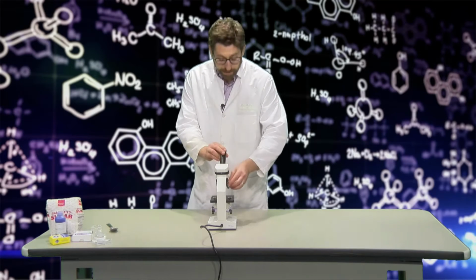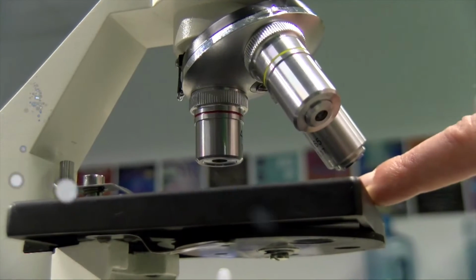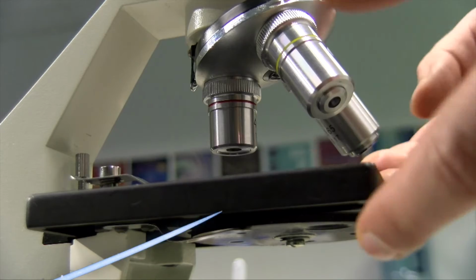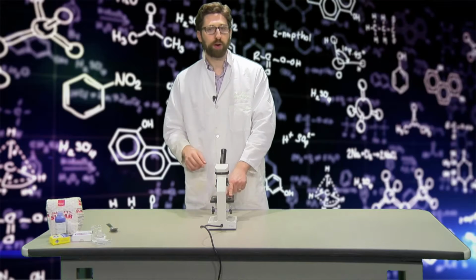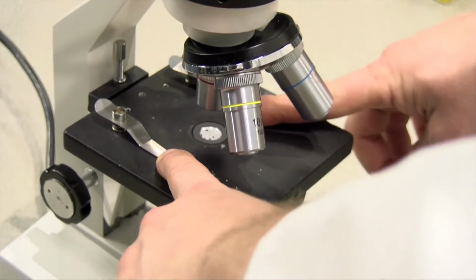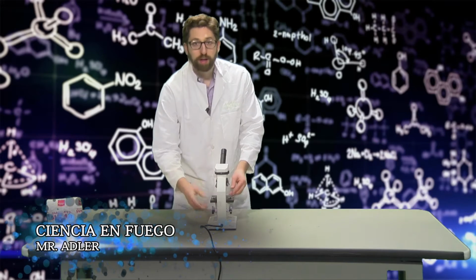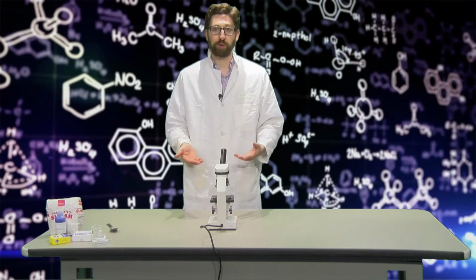Now I've got my eyepiece and I've got my objective lenses. Let's keep going down the microscope. Now this is the stage. Just like if you were at a play, actors act on the stage. If you're using a microscope, you put what you want to see on the stage. We'll get there in a minute. You can also see I've got some nice clips that help me actually keep my sample on the microscope stage. I've also got these focus knobs. As I turn the focus knobs, the stage comes up and down, which lets me bring my objects into focus.